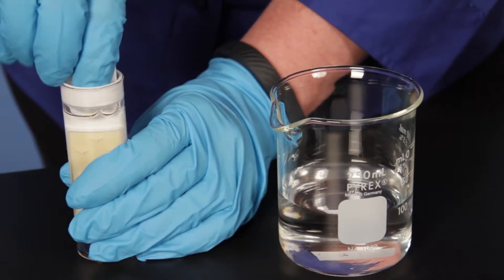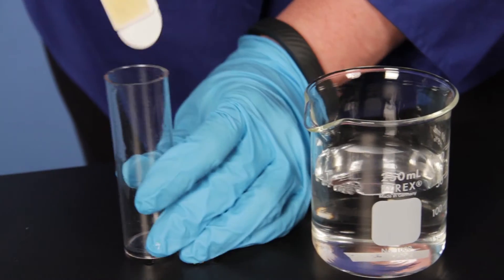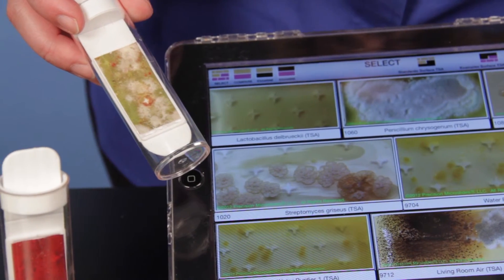They have a longer life than traditional petri dishes, no refrigeration is required, and have simple incubation needs. This product comes with a free LaMotte Biopaddles Colony ID Lite app.